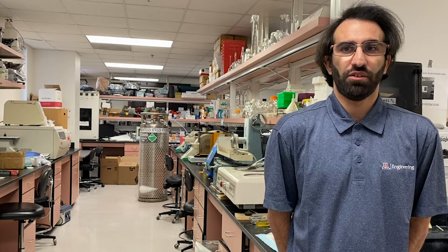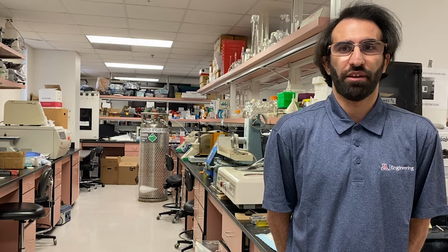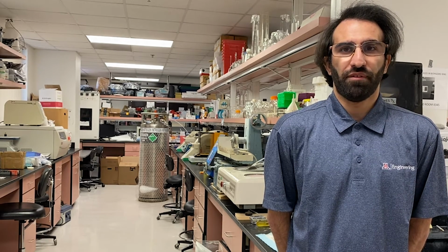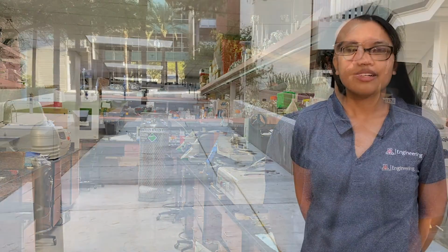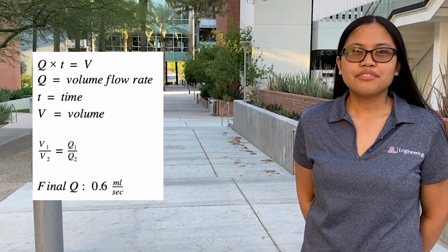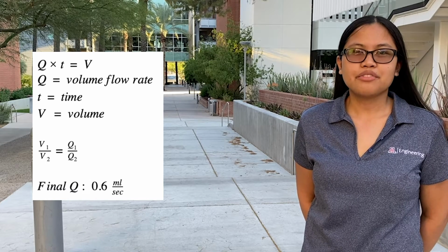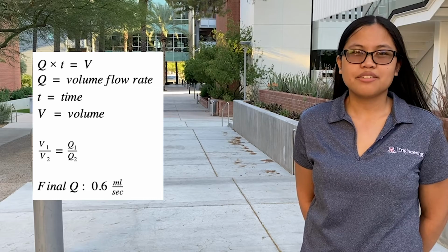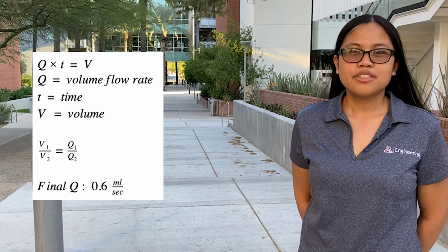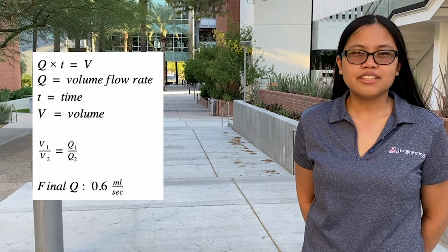By injecting new medium through the force applicator bolts, we are able to elevate the injection tubing and reduce the clutter entering the wells. In designing our system, we extensively researched requirements for media exchange and cell culture. We modeled our fill rate requirement off of an established fill rate for a small well plate size and scaled this rate for the larger volumes of the well plates our system caters to. We chose this lower of the two rates to avoid damaging the growing tissue.